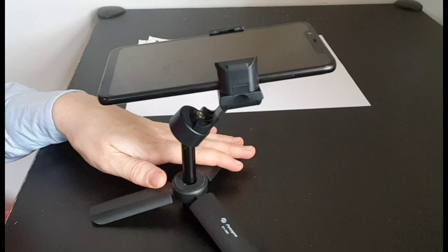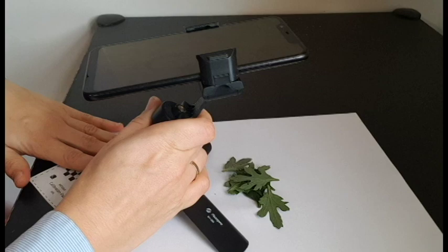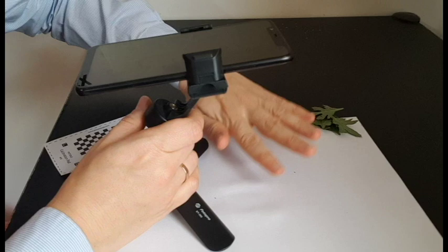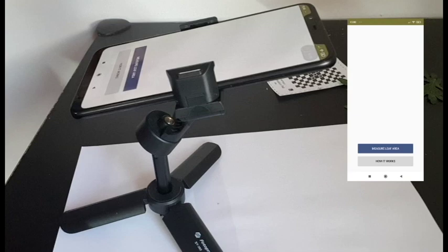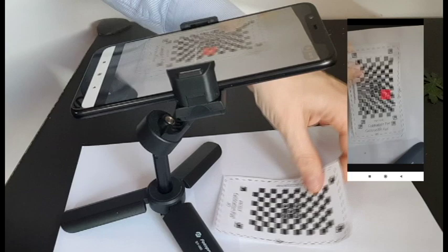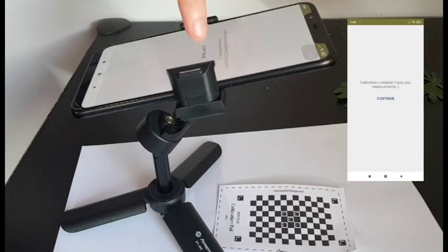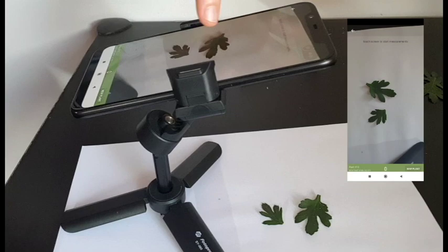When your phone is ready, it's time to place it on top of something white. Then we need to take the leaf slightly back. Now it's time to start working with the mobile application. We need to launch the mobile application, then press the leaf area measurement option and calibrate the camera. Place the calibration pad in front of the camera until you see the green square.